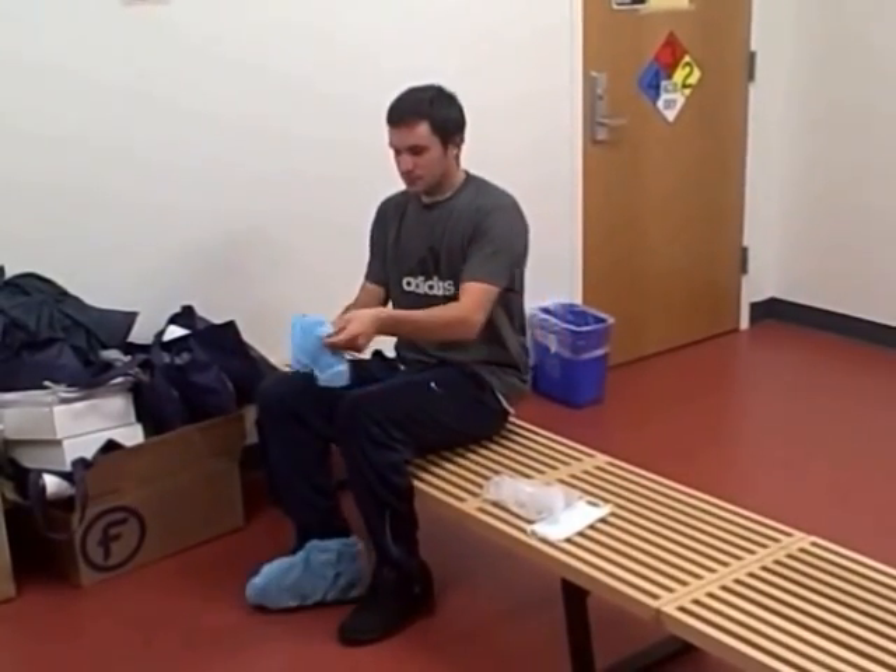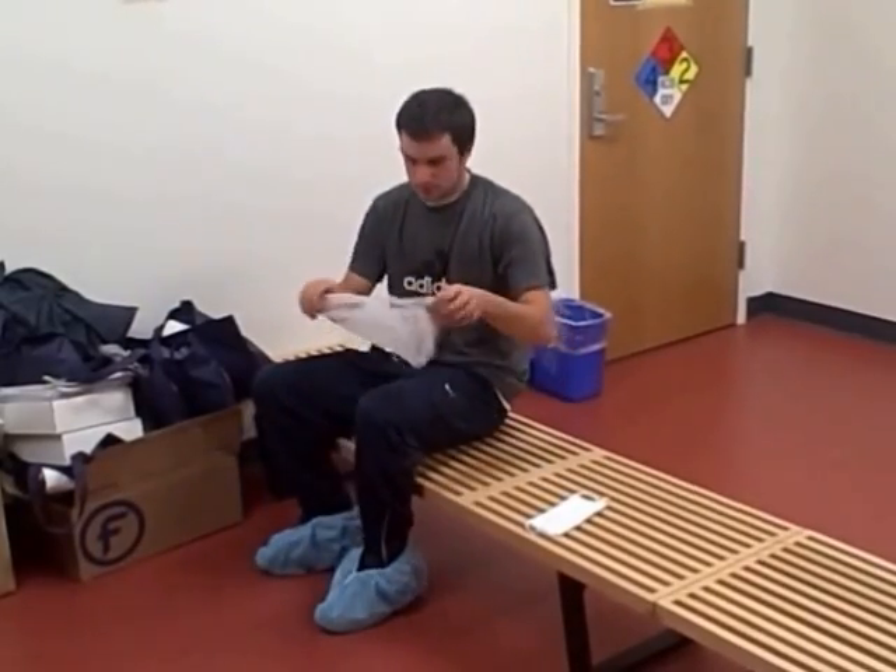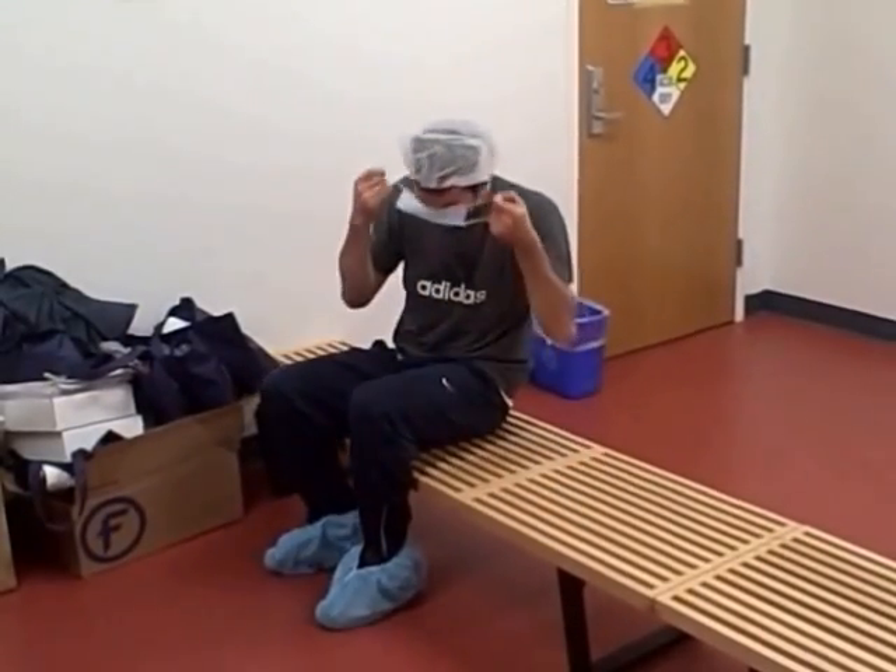Make sure that the pleated side is facing out. Adjust it to cover the entire mouth and nose. Stretch the hairnet over your ears and over the straps of the face mask.